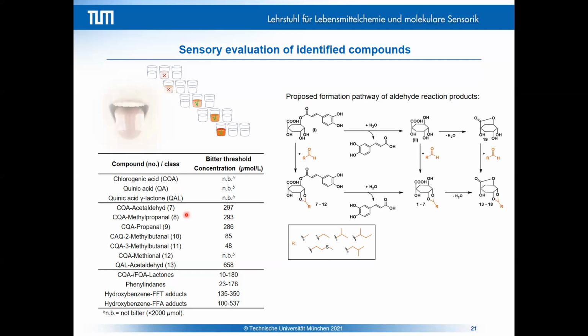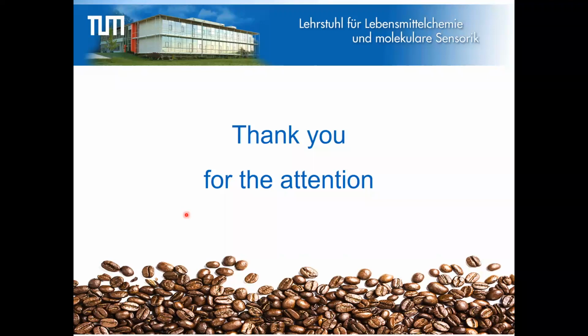So this means that not one of these compounds will have a direct impact, but there might always be some synergistic or additive effects. And of course, the aldehyde, the aroma that is bound, is no longer perceivable for the aroma of coffee. And with this, I am at the end of my presentation, and I would like to thank everybody for the kind attention. And if there are any questions, please feel free to ask.